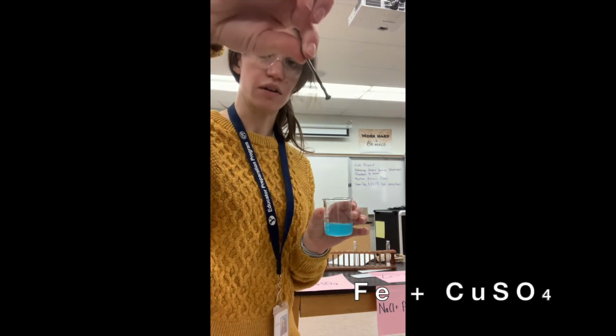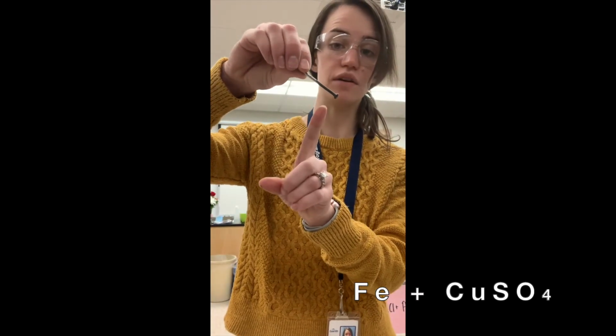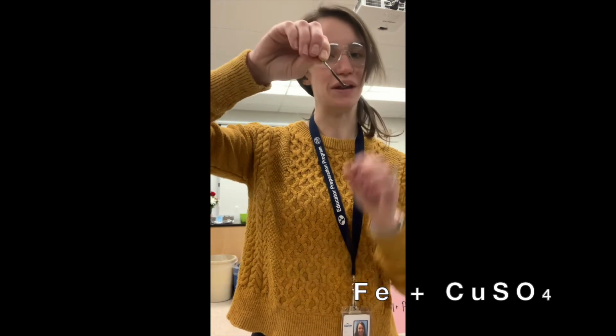So this is what our nail looks like. You can see that clear difference between the color of the nail that was in the solution and the nail that wasn't. And this is evidence of the chemical reaction that's happening when we put it in the CuSO4.